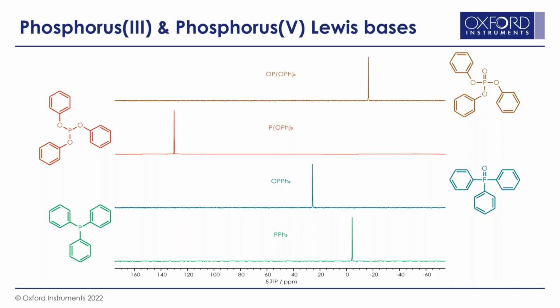Like carbon-13, phosphorus-31 NMR spectra are usually obtained proton decoupled, with signals observed over a spectral range of +200 to -250 ppm. Since, unlike carbon, most phosphorus-containing compounds only contain a small number of phosphorus atoms, the resulting sharp signals are usually easily distinguished and can vary significantly with only a small chemical change.